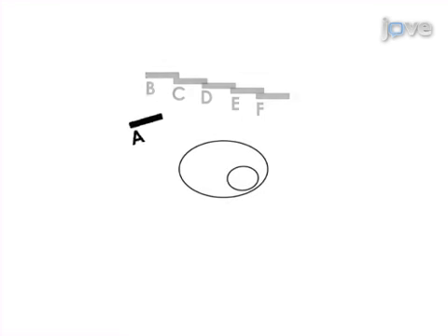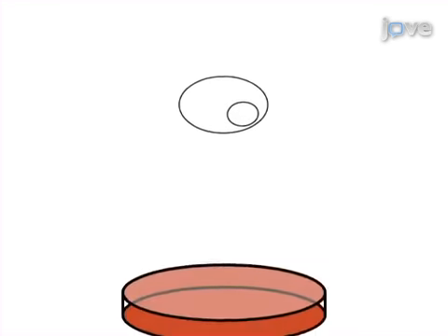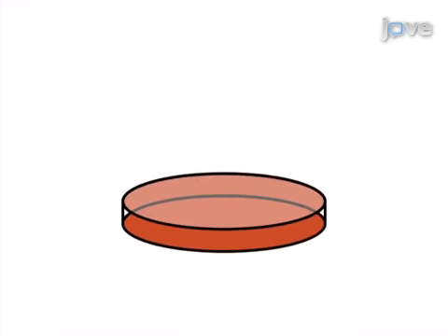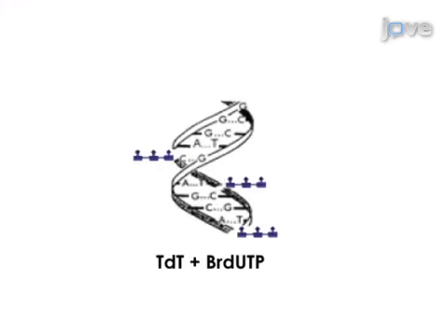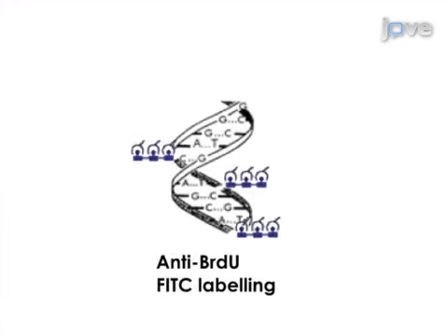To identify apoptotic motifs in HIV-1 Nef, Jurkat cells are exposed to Nef scanning peptides, and a TUNEL apoptotic assay is performed to identify peptides that induce apoptosis.